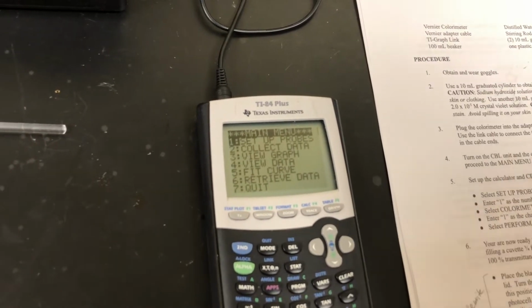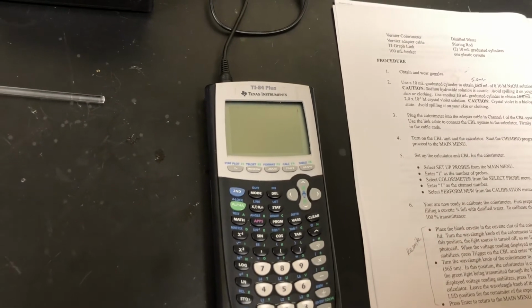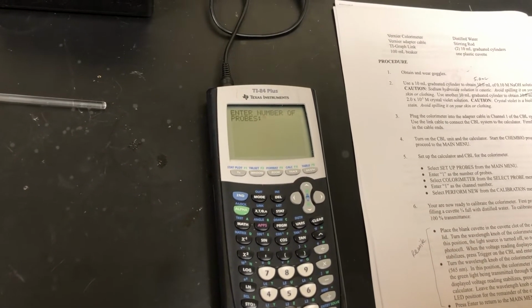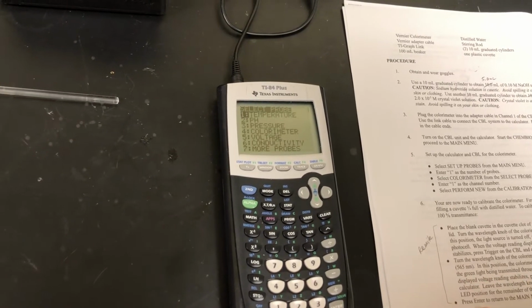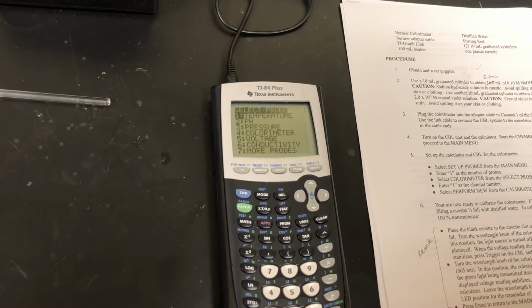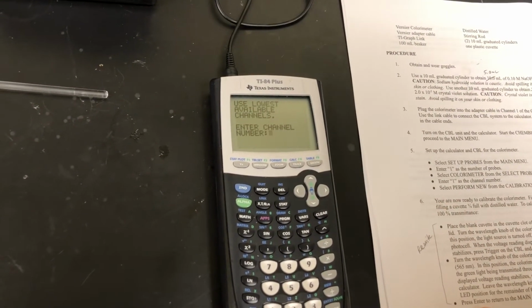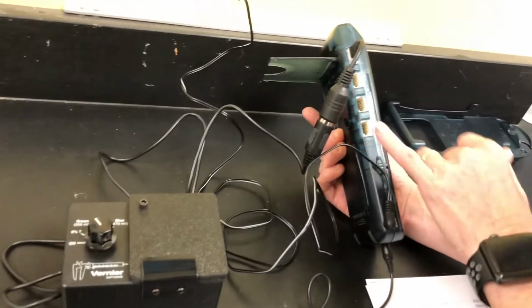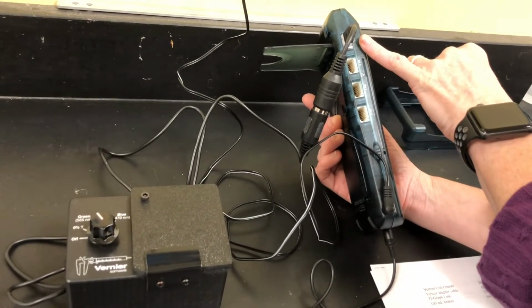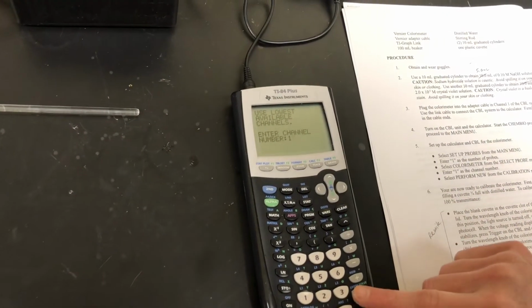So before we collect data, we want to set up our probes. You want to hit either enter or 1, and that will select set up probes. We have 1 probe, which is our colorimeter, so we hit 1 and then enter. And then they ask us what kind of probe we have. Well, we have a colorimeter, so I'm going to hit 4, and that'll select that. It says use the lowest available channel. What that means is the colorimeter is plugged into channel 1 here. So when it says enter channel number, I'm going to put 1 and hit enter.